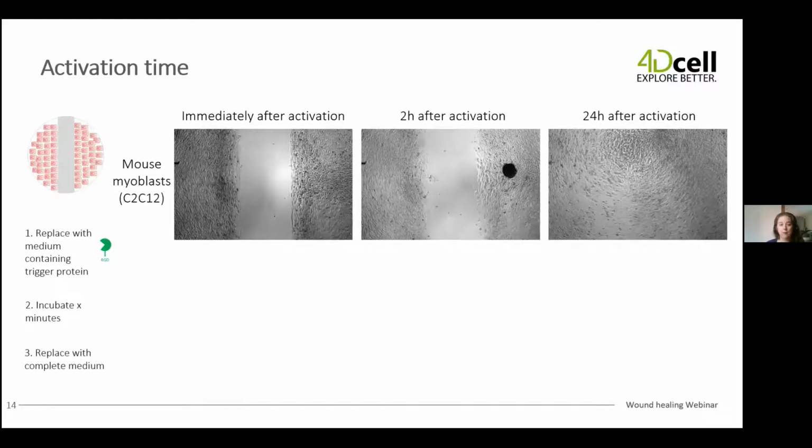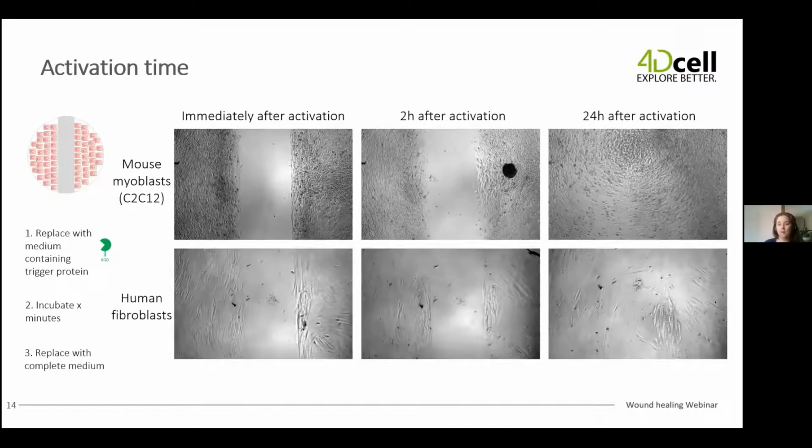And in my experiments with mouse myoblasts, and I'm showing also human fibroblasts, I saw that the cells migrate into the wound and migrate quite nicely. In all experiments that I did, even as short as 1 minute was sufficient to have a complete closure of the wound.